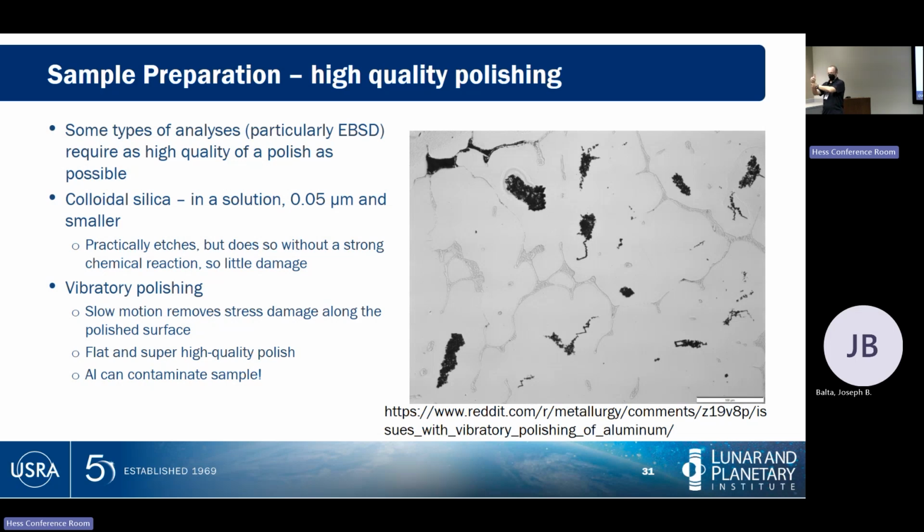it. So if you're trying to measure the precise orientation of, in steel, two different crystals of the steel, because the offset between them is really important for the strength of the steel, and you've imposed a 2 or 3 degree damage zone on the outside, that'll carry through to your analysis. Cleaning up that layer becomes very important. There are ways to do that.